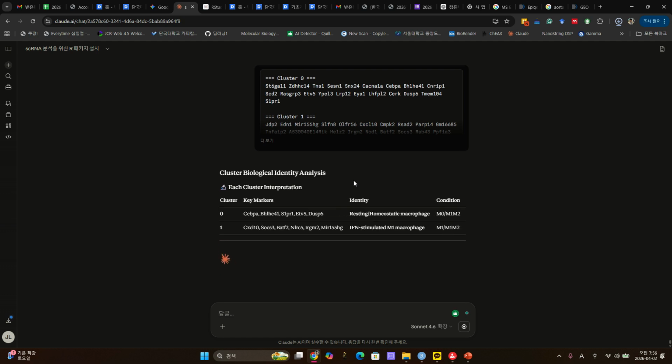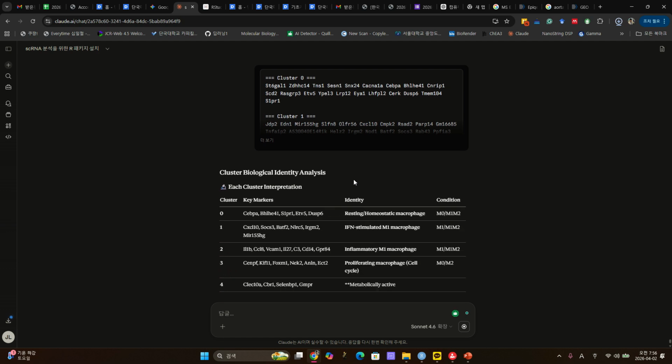Without AI, maybe you have to analyze one by one from the top 20 genes. Okay, what is the meaning of this? And then you have to study based on the paper, and you're not that expert in that area. It's not easy to see what is the meaning of this gene, and it takes a long time. But now you have AI. Ask them. Within 1 minute, they're going to show you the result. Even though it's your first time to visit that field, like nerve tissue, just ask, and they're going to give you very good suggestions.